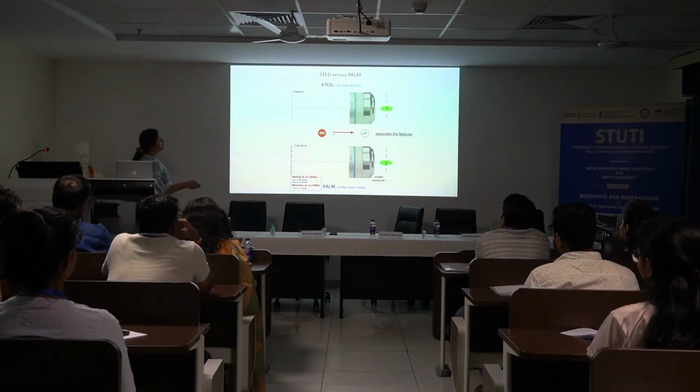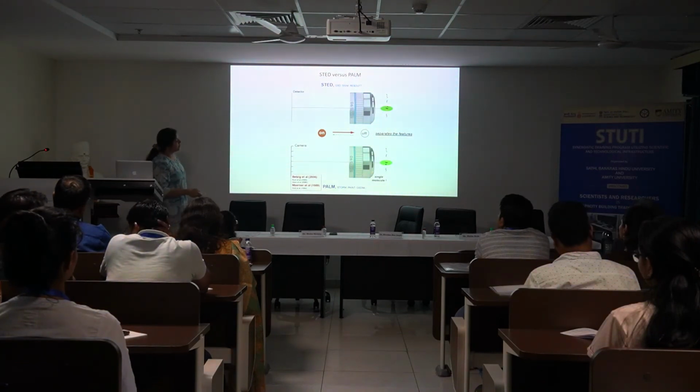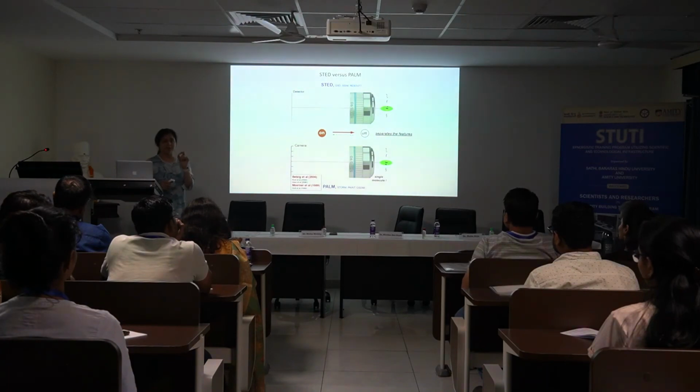And then again to reiterate, in both of these methods, you're looking at the distinguishing feature of an on-state and an off-state. And in the case of PALM, the premise itself is by looking at single molecules getting activated, you are automatically getting single molecule resolution, right?